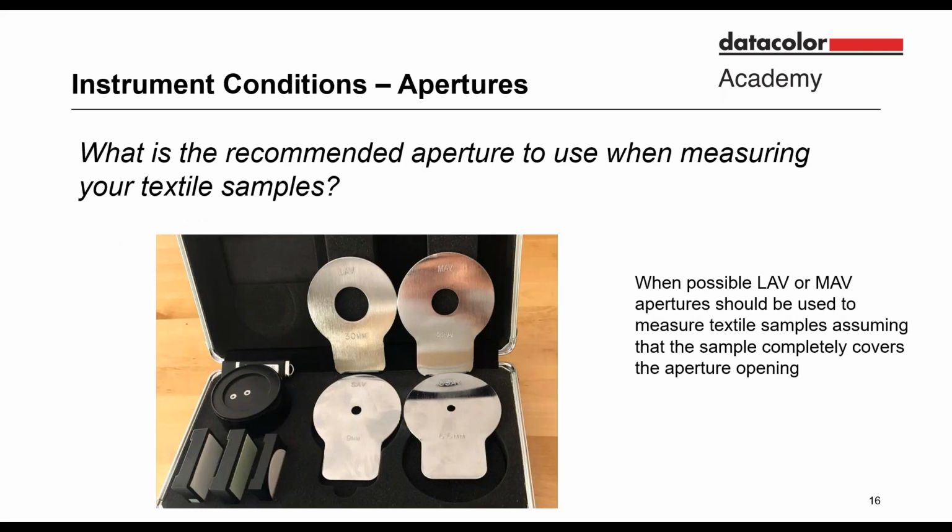Regarding the aperture, what is the recommended aperture to use when we are measuring textile samples? The first answer to this question is, how big is your sample? Sometimes we have no alternative but to use very small aperture sizes because the sample we have received from the customer is very tiny.